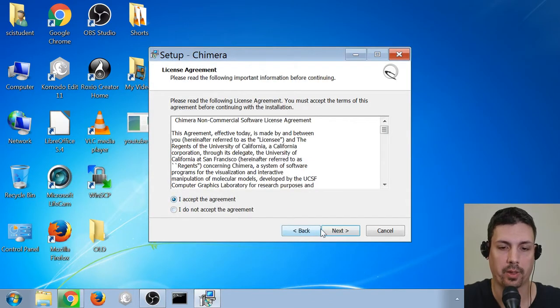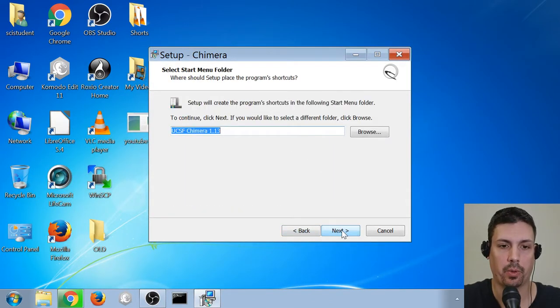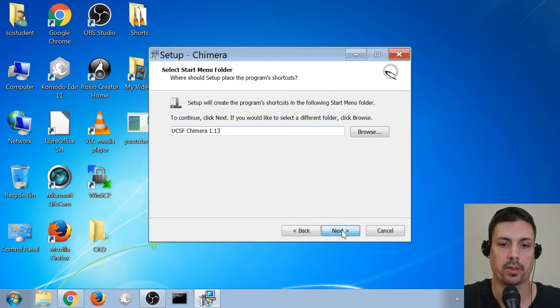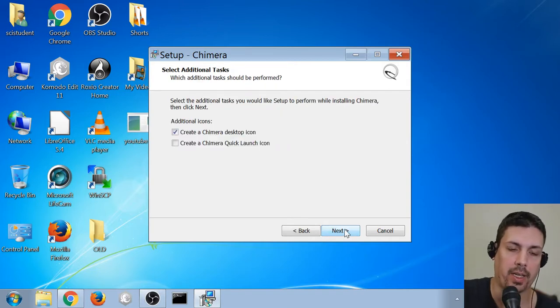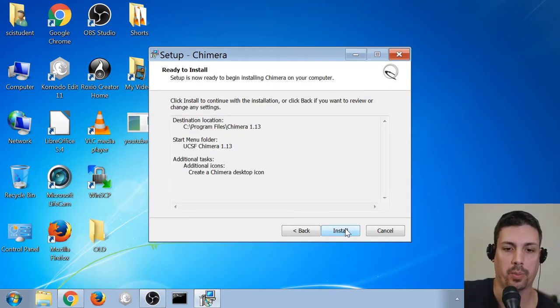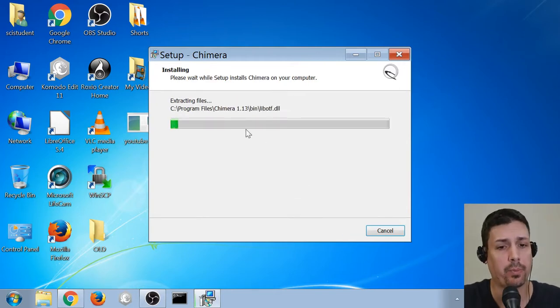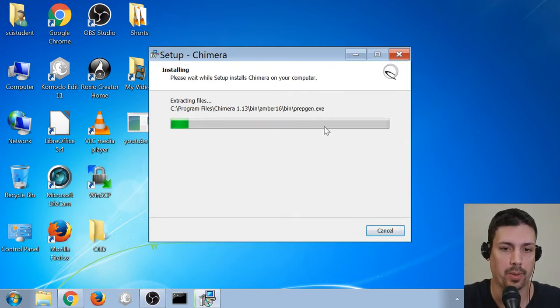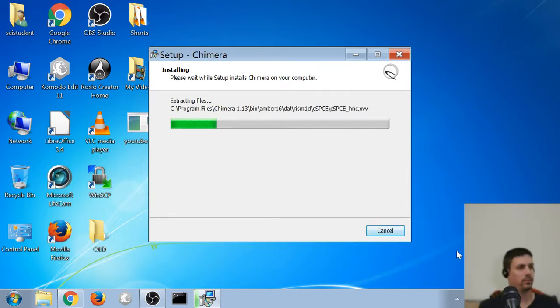Next, accept the agreement, click on Next where we want to save the files, create a menu, create a desktop icon. This is how I'm going to be using it to launch the program, and then click Install. This is a pretty long installer, it goes fast at the beginning and then slows way down around here. So I'll just speed up the video at this point.